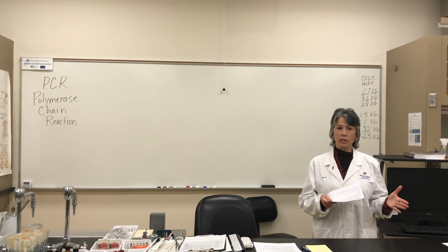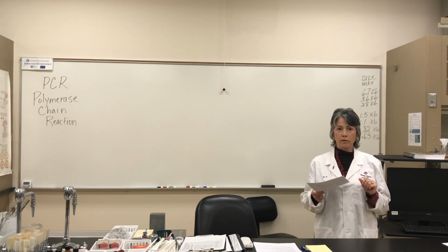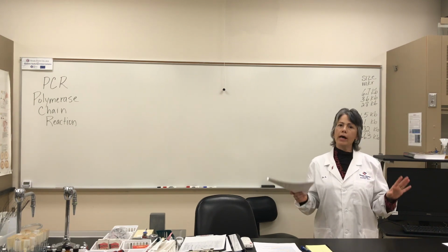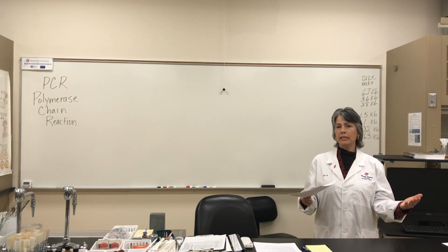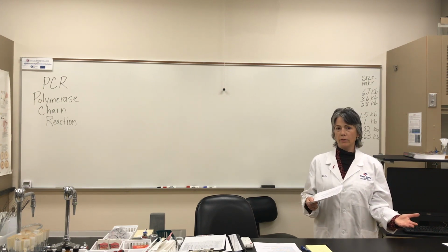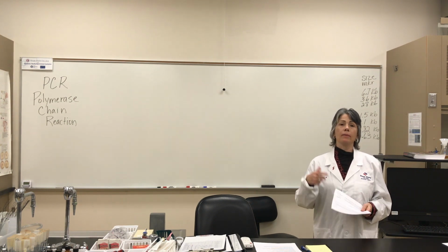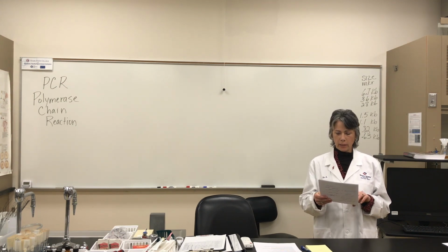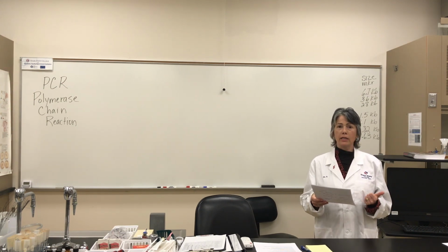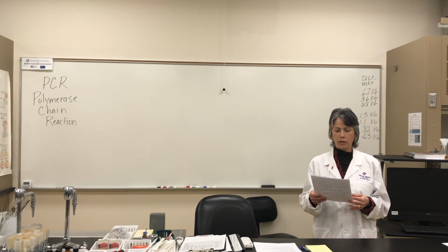They're taking a patient sample, using PCR to amplify specific regions. I'll slow down and tell you this story in a minute. And then they might be sequencing the PCR results, the reaction result. They might be running it on a gel as we're doing for this experiment. But both PCR and ELISA are new technologies for testing for infectious diseases.